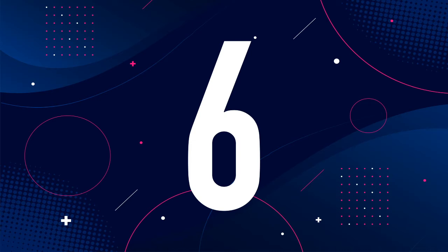Now, the way that this works is really just based on how the light is passing through that filter. When I'm using bright field, my light is hitting my specimen directly. When I'm using dark field, the light is hitting the specimen, but what's hitting my oculars is the reflected light. It's almost like looking at a shadow of somebody. Like if I shine a flashlight on them, I'm looking at their shadow more than them. Okay? So it just is dependent on which way the light is flowing. That's really the big difference.